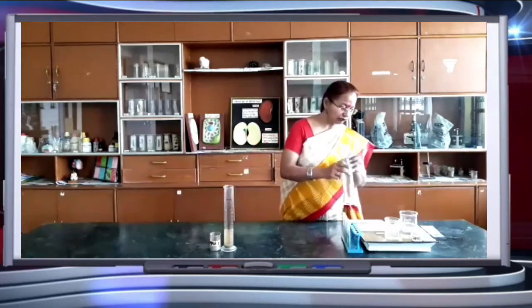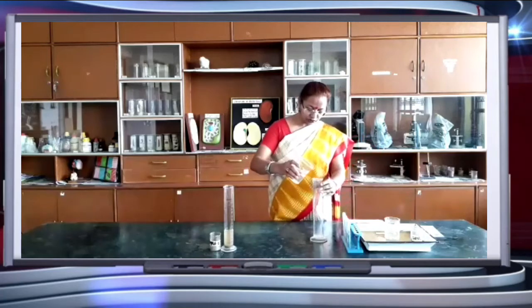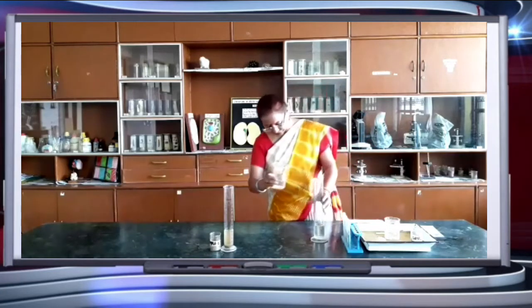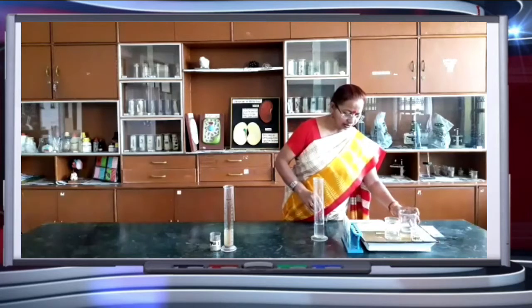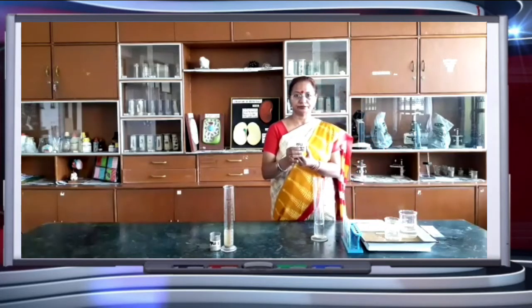Same procedure we will follow with the second sample of the soil. Water can be added approximately as well. Now this is sample 2.